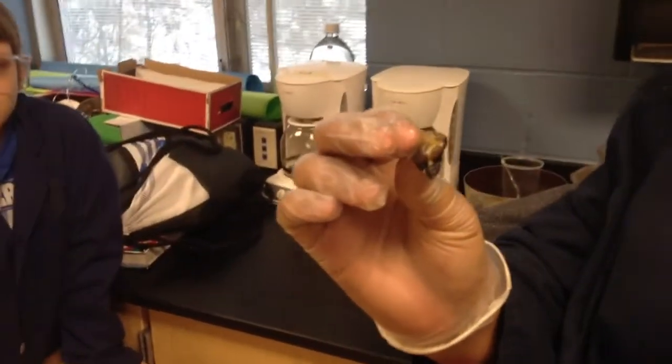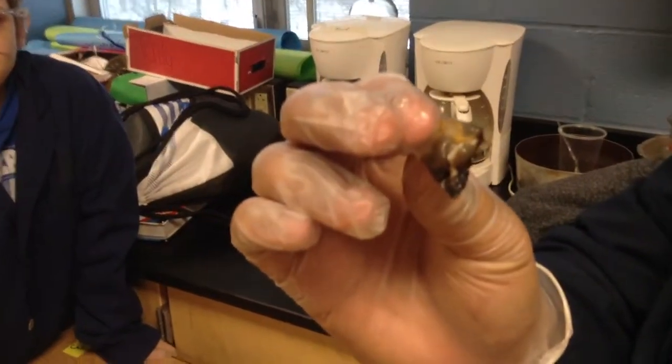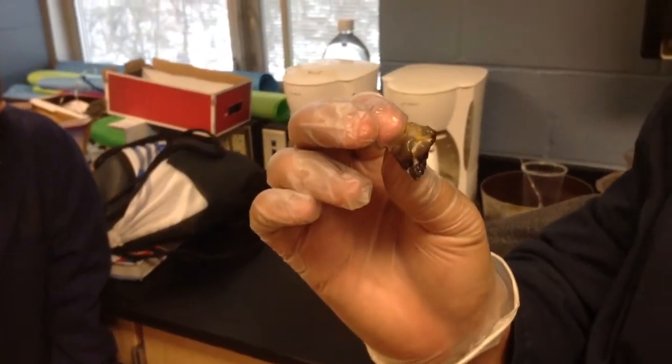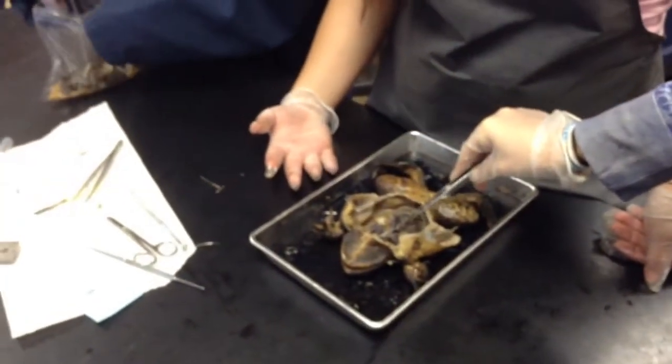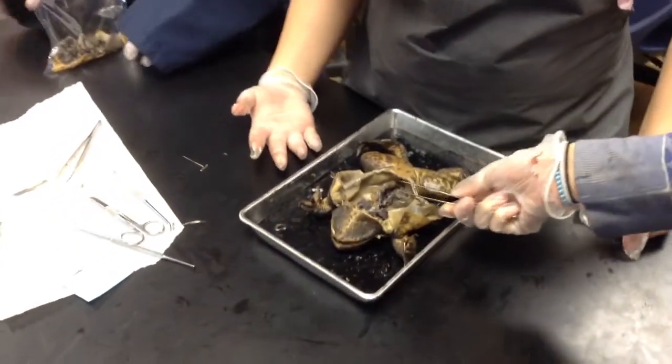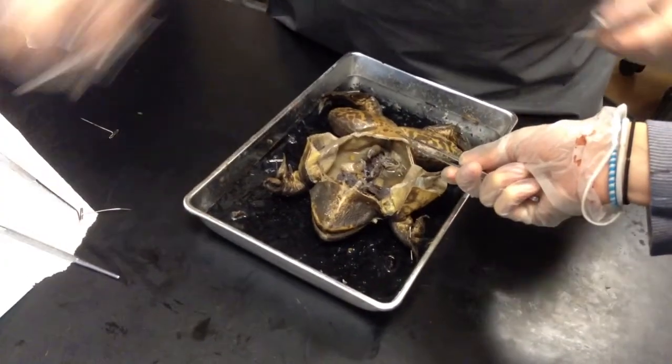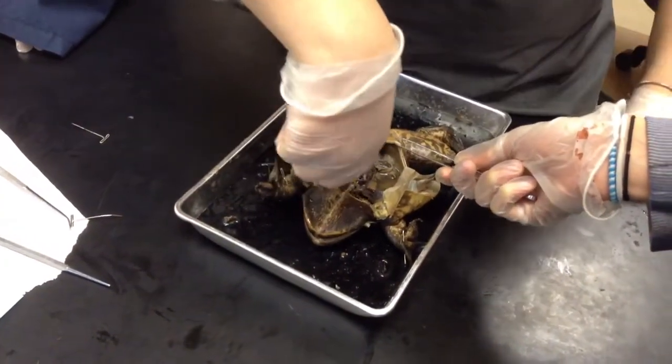Okay, so we have a three-chambered amphibian heart. You get one large and one small. The small comes after the stomach and then you get the large. You guys can take that out. You're going to get — you guys see the spine back there?